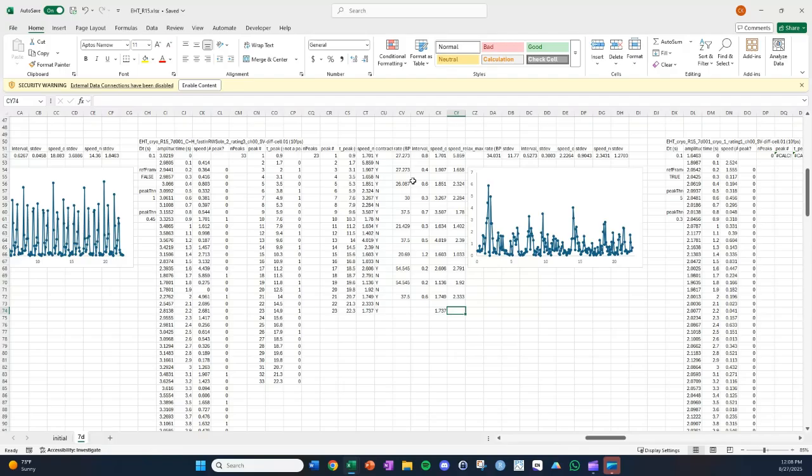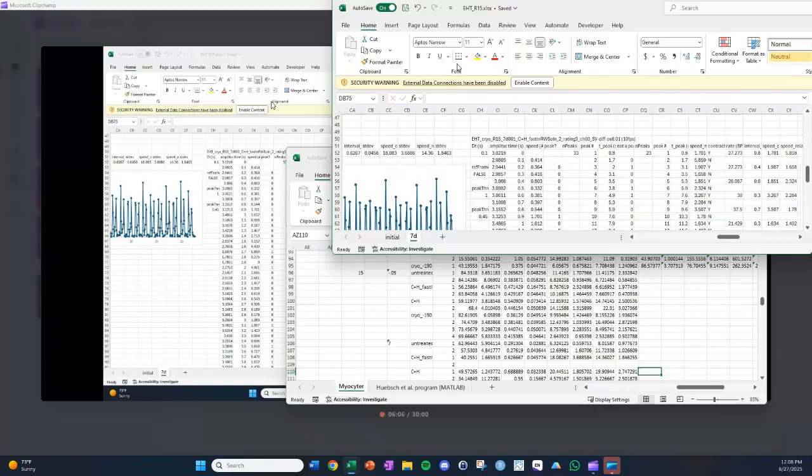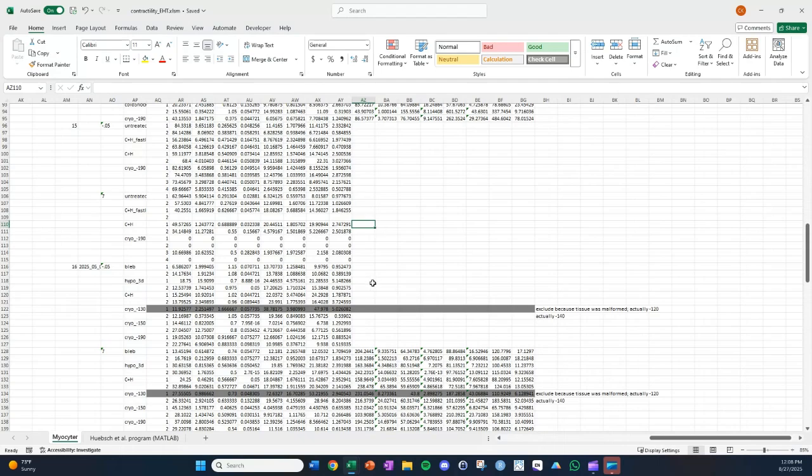All right, and now what's left to do is analyze all the other videos, which I actually did in between the time taking these videos. So then go ahead and paste these into another spreadsheet. So I have a spreadsheet here that contains all of my data.